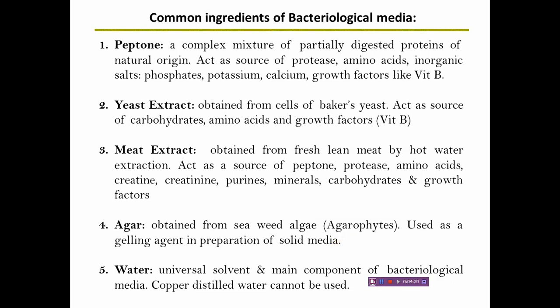Agar dissolves in water, and at a concentration of 1 to 2%, it forms a solid, tough gel, and that is why it is used for the preparation of agar plates or solid media over which the bacterial cells can be inoculated.